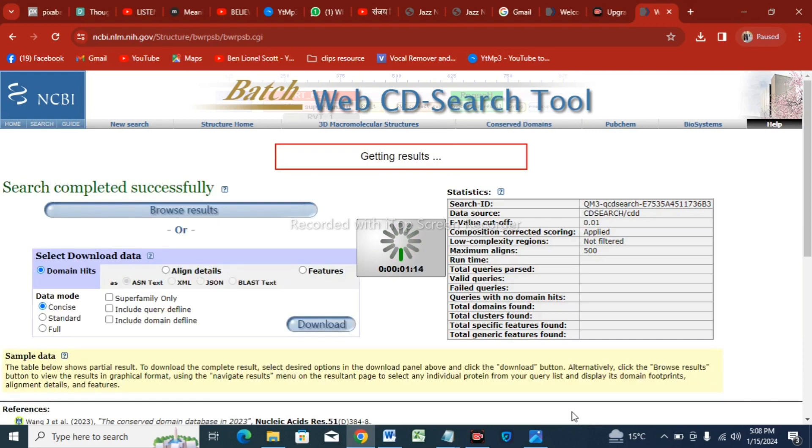This is great. Now download this data file that will be known as heat data file. Tap on the download option.